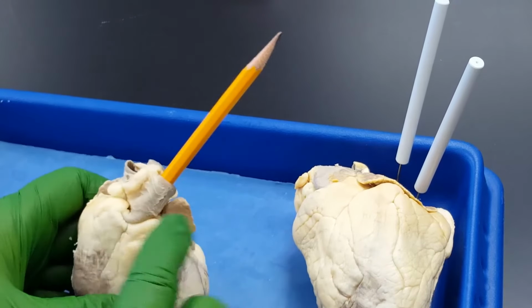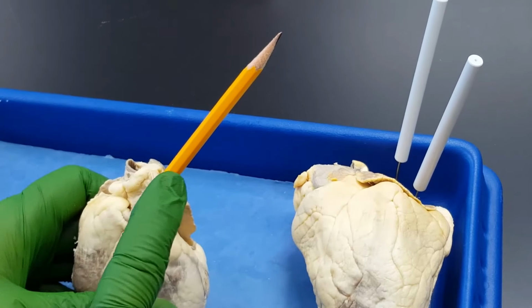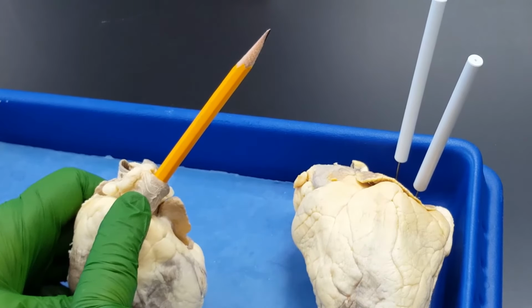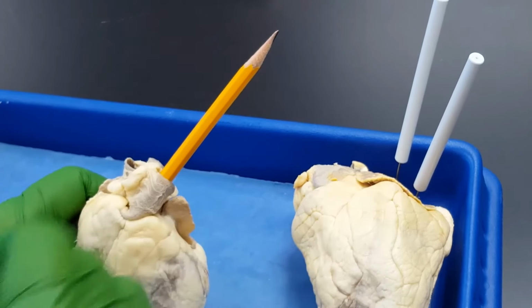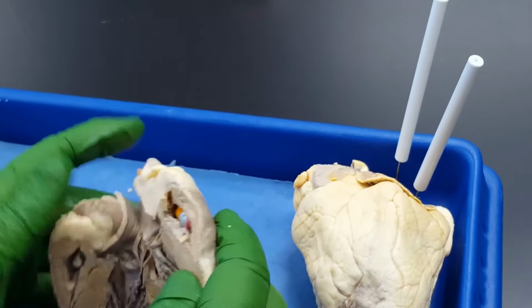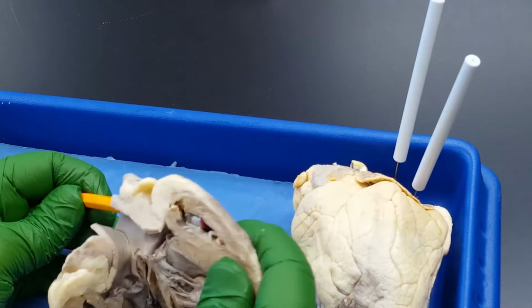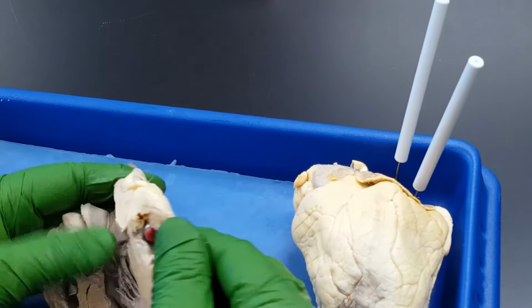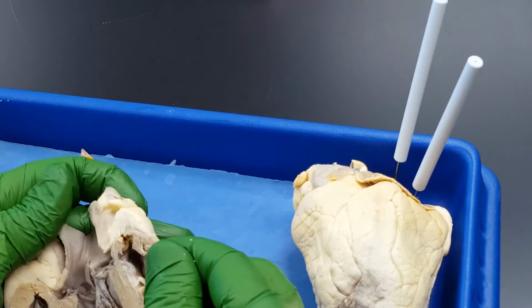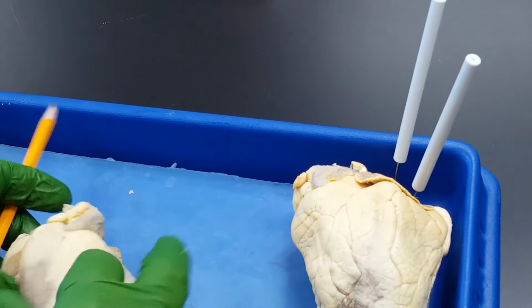I hope everybody sees that. Pulmonary artery, or since it hasn't bifurcated or branched yet, we say pulmonary trunk, which is one of the great vessels. So pulmonary trunk, the pencil is in the right ventricle. Aorta, pencil is in the left ventricle. And the pencil has passed through the pulmonary semilunar valve, which is the hardest of these semilunar valves to find, but it's right up there. The aortic semilunar valve isn't very difficult.